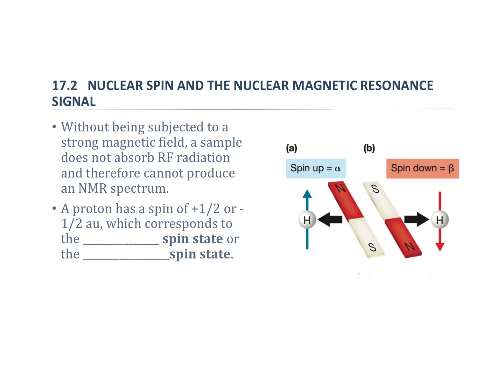Okay, so we can't get an NMR spectrum unless we use a magnetic field. Well, maybe the big burning question here then is why? Well, if you're acquiring an NMR spectrum and it's going to depend on the strong magnetic field, it depends on it because of nuclear spin.